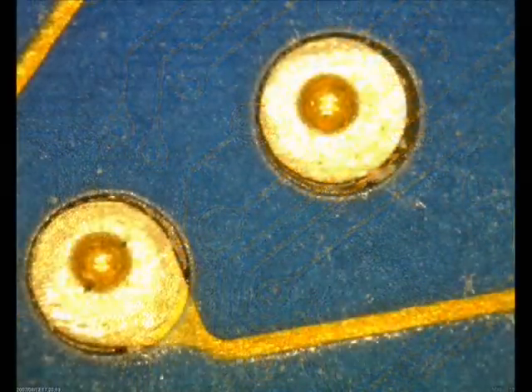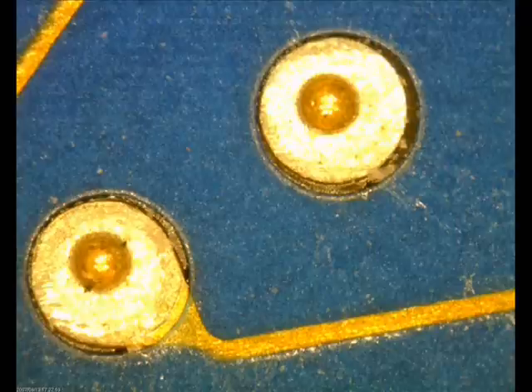For the high magnification values, you can only get focuses around 160x to 230x by almost touching the object.